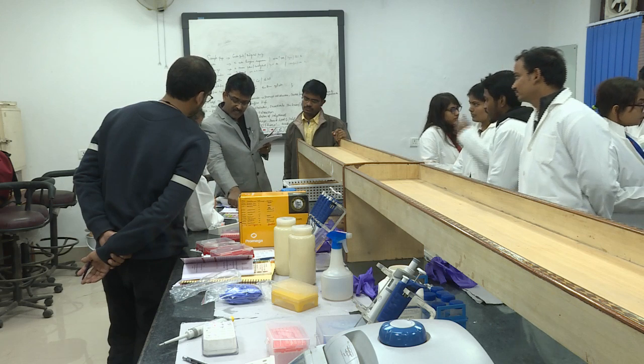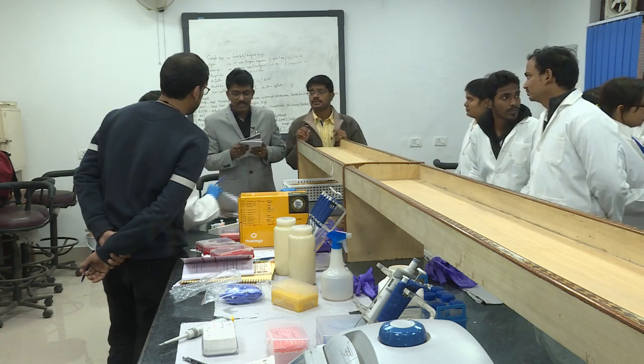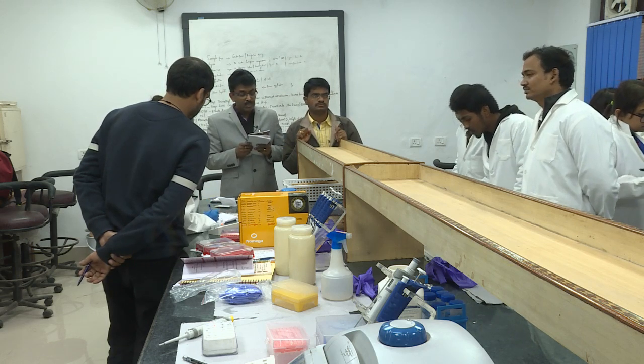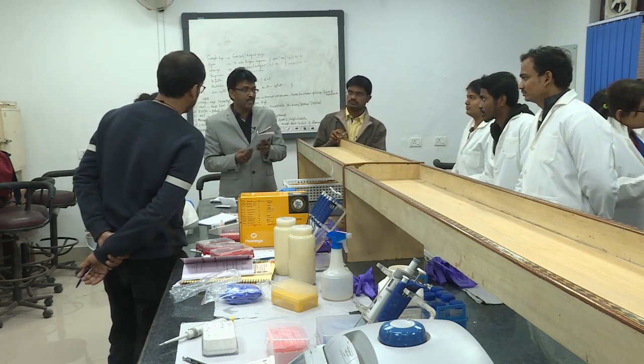Yeah, forget it. That is for soil DNA. You don't have to bother. Forget it, it gives humic acid contamination. You forget it now. Okay. So, not bad. The Magnaporthe DNA yield is invariably something like this only.